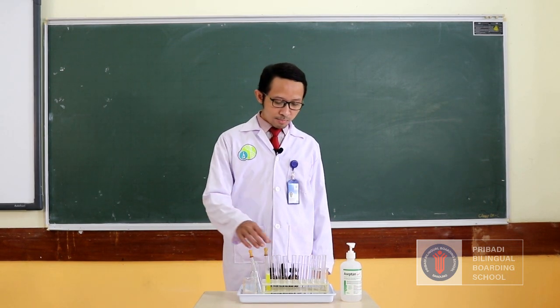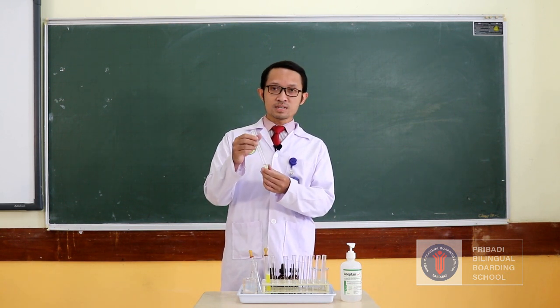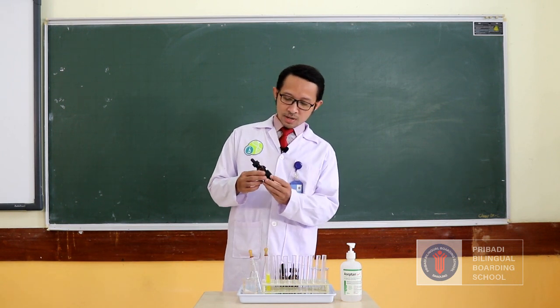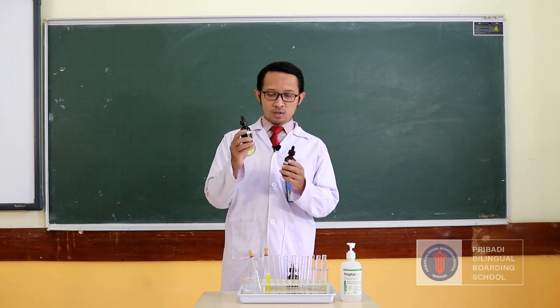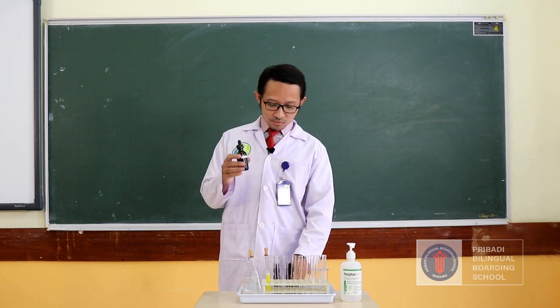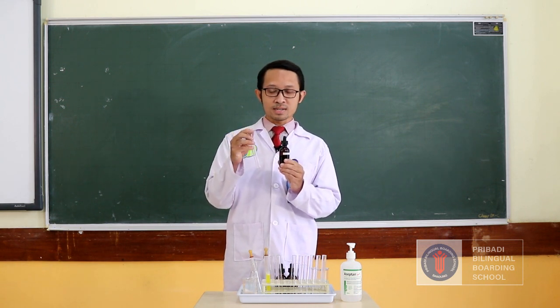In this video, I'm going to show a virtual demo about lab activity. We are going to have a food test. We have three different solutions here, the reagents Lugol, Benedict, and Biuret. The function of Lugol is to test the presence of carbohydrate in a food sample.